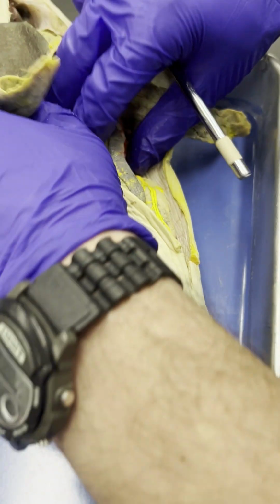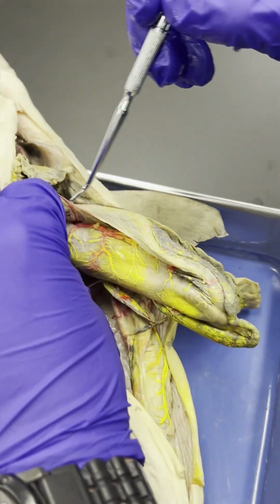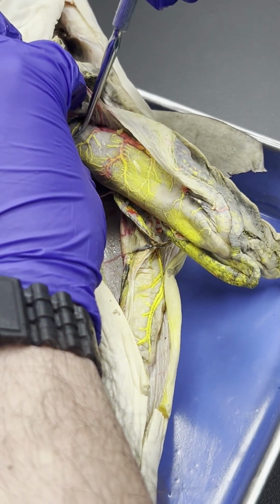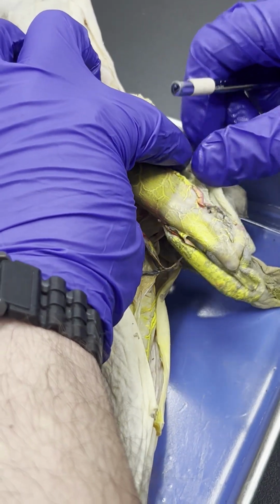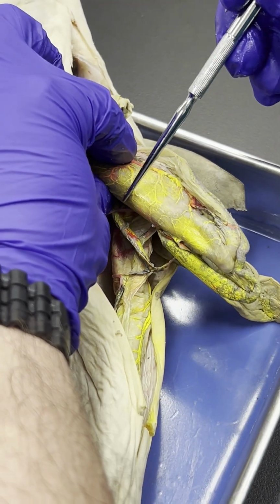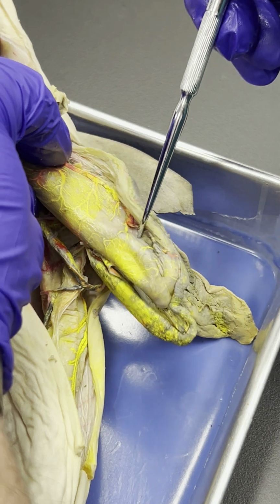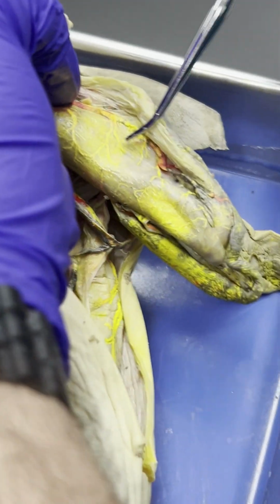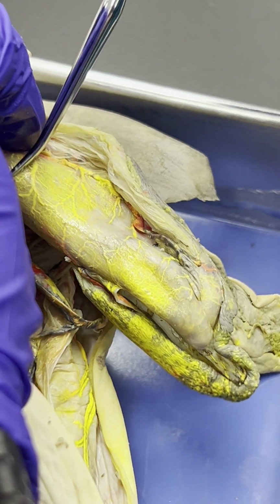So let's see if we could find our stomach. And here is our stomach right here. There are different structures attached to this, but this long structure right here is the shark's stomach. The stomach is broken down into two different parts, the greater and lesser curvature. So here is actually the greater curvature of the stomach, which is basically the outside. And when I say outside, I mean circling around this structure right here. So here is the greater curvature of the stomach. And the lesser curvature of the stomach is more or less going to be inside this stomach. Not literally inside the stomach, just inside what I'm showing you right now.